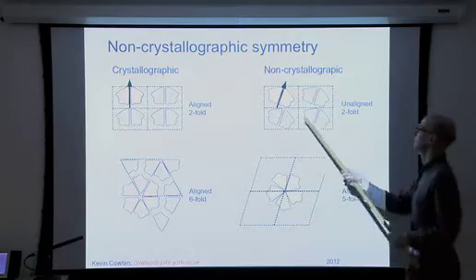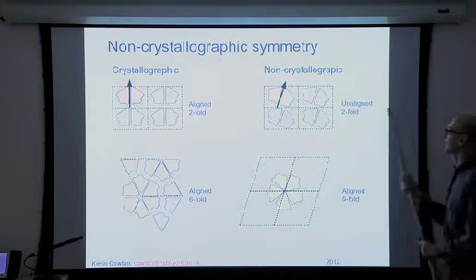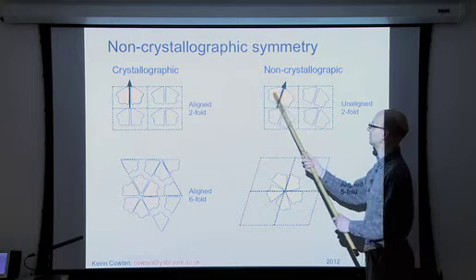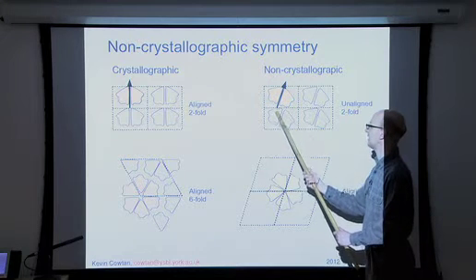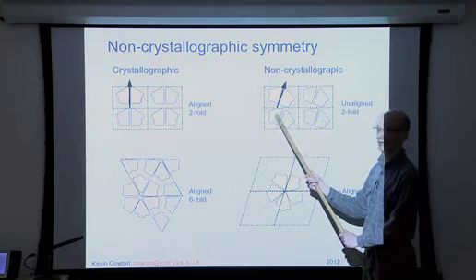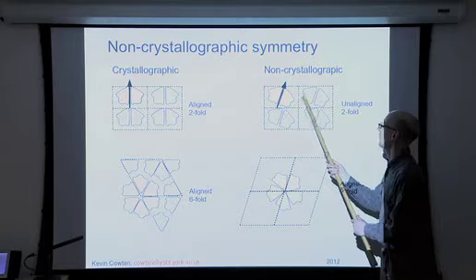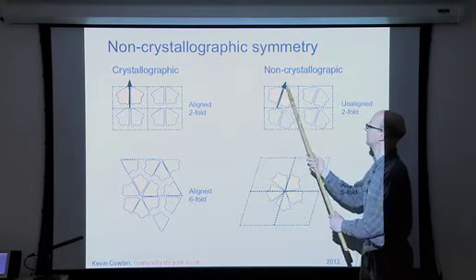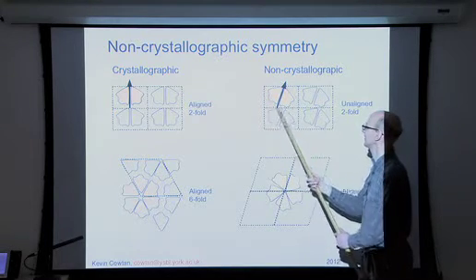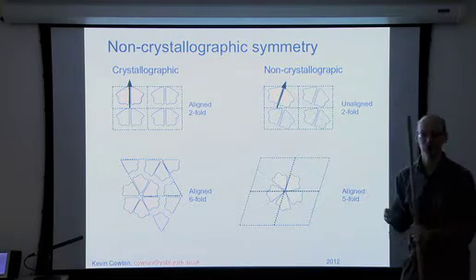Non-crystallographic symmetry, the important distinction is that it's local. So here we are. Here's a twofold which isn't aligned with the unit cell axes. So it maps this molecule onto this molecule. The same axis maps this molecule onto itself about here. So it would clash with itself if we flip this over using this axis. And if we apply the symmetry axis to the lattice, this rectangle becomes this one, which doesn't match at all.